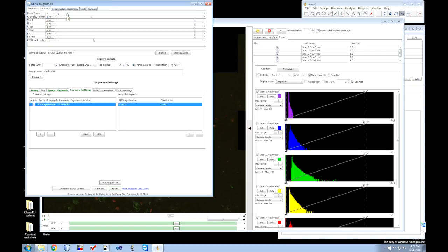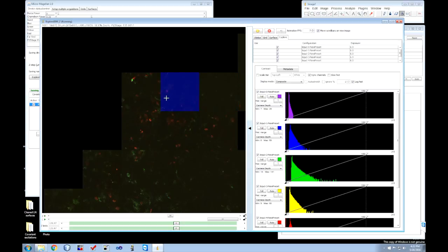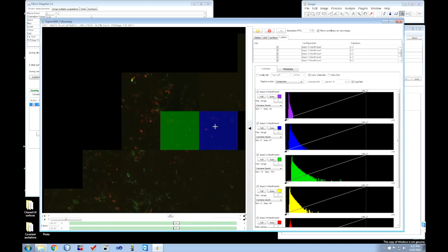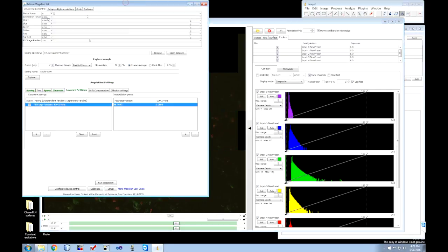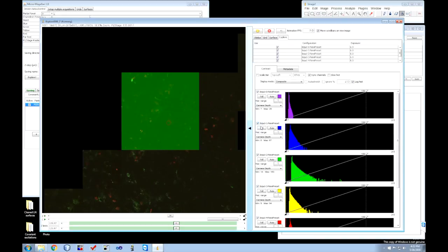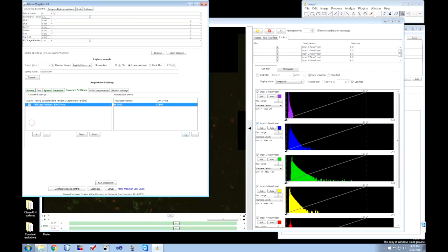After updating the laser power in the device control panel, we'll continue re-imaging the same region. We will repeat this process until we find sufficient brightness in our image. After that, we can enter the value of laser power that we used to collect it into the covariant pairing list. We now repeat this process at several different values of Z.